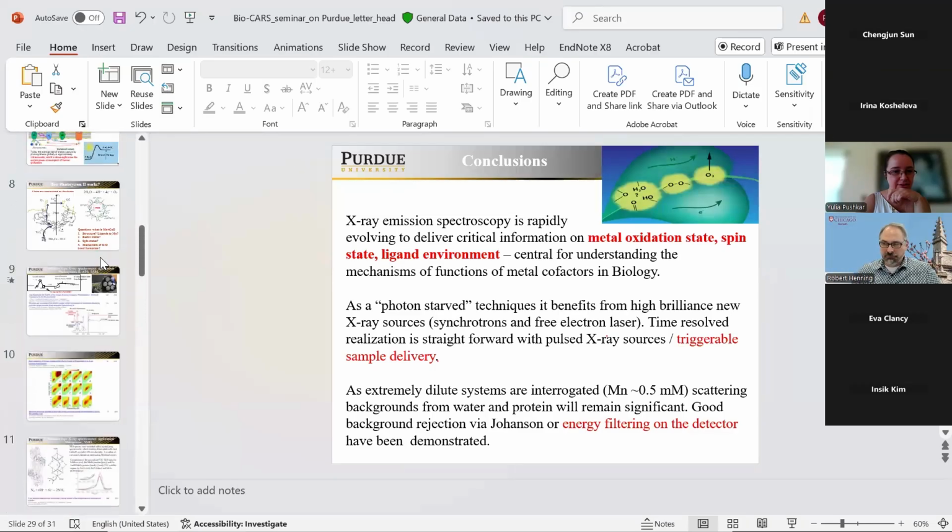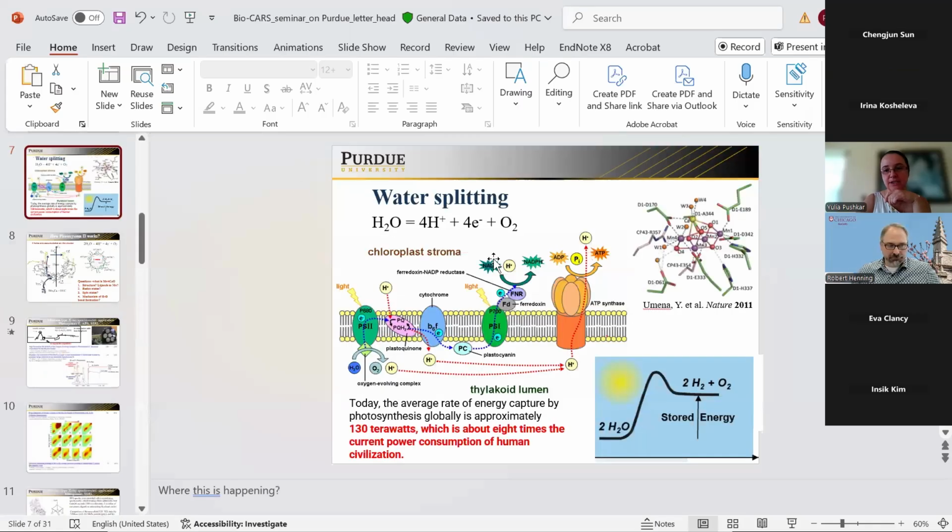I'll just use this general cartoon I have here. There are a lot of questions because you have those bridging oxygens, and maybe you have terminal waters. No one knows the protonation state. Even after all this high-resolution crystallography, they say this manganese 4 might have 2 waters, or 1 water and 1 hydroxide, 2H, like no one knows. If we could even figure out those protonation states, it would be a big step forward. Because there are waters and OH, they exchange protons really quickly, so those will get deuterated.